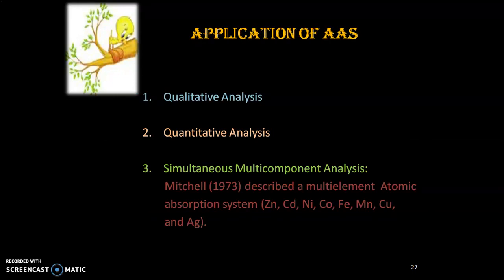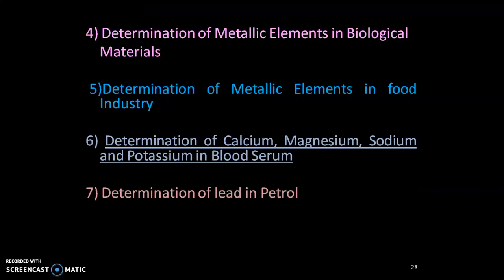Application. This technique is used for qualitative analysis, quantitative analysis, simultaneous multi-component analysis, as well as for determination of metals in biological materials, determination of metallic elements in the food industry, determination of calcium, magnesium, sodium, potassium in blood serum, as well as for determination of lead in petrol.